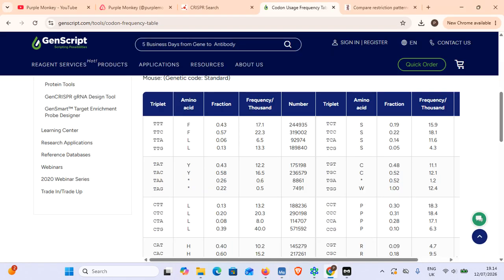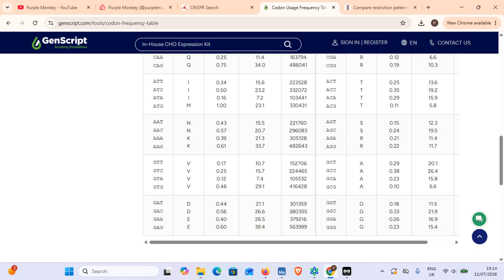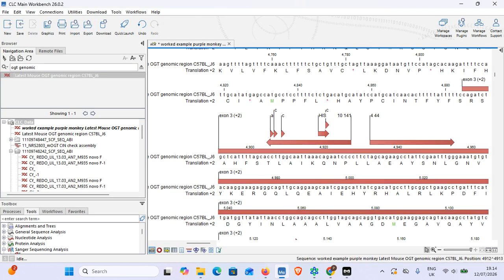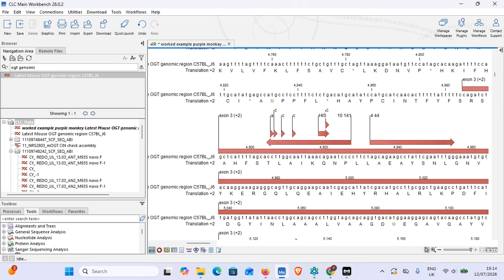So let's see now, panning over here, GCA, where are you? Hello, GCA. And, lo and behold, GCC will, another C, do just famously. It also pushes up to the top of the popularity ladder. So GCC becomes our guy over here. Add this guy, right-click, and add another C. Okay, so that guide RNA is thoroughly stitched up. The changes that we're planning would be more than adequate to totally eradicate the guide RNA recognition.